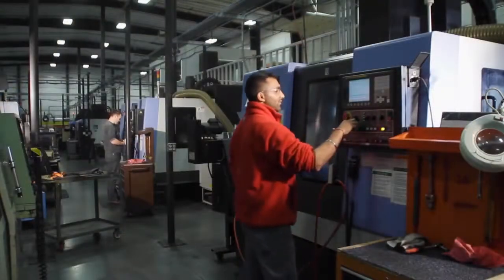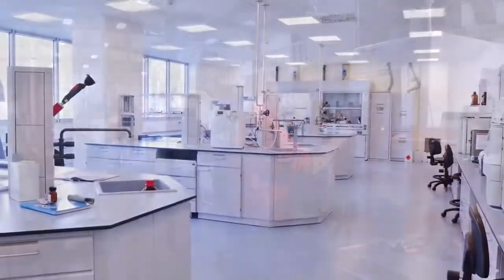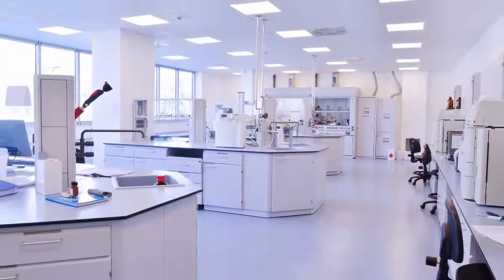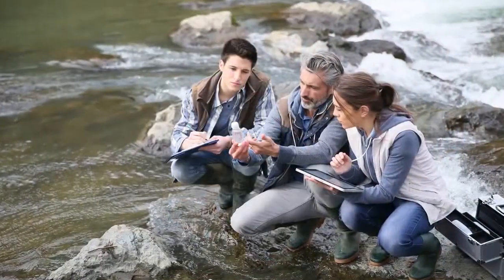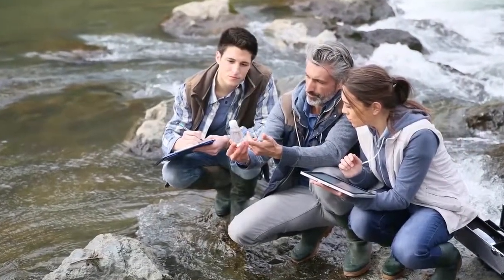The CTX can be found on production lines for pre-screening or as a backup to central laboratory XRF and ICP analysis. The CTX provides the same immediate feedback results of portable XRF for educational research in and outside of the classroom, but in a double safety interlocked configuration.